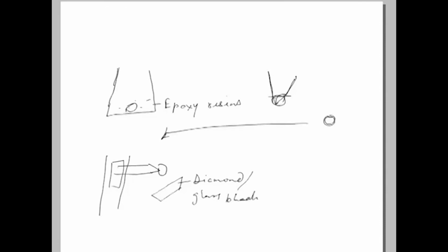Now, this one has a property that it will give much thinner ultra thin sections like I said than the simple microtome. It could be placed in cold conditions if certain cryo techniques have to be used, that we will discuss later on. Now, this is a water trough here, as the sections are cut in here, these sections will fall off onto the water trough from the edge of the knife, and then these could be picked up by a specimen holder.